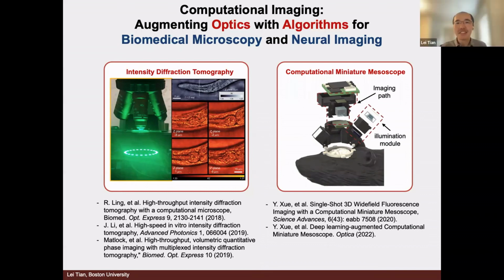Thank you. I'm interested in everything, basically, but in the interest of time, I'll ask something about the first part, on a particular application. With Pierre, for example, we're trying to put together a little computational microscope for pollen imaging in honey, to determine which kind of flower origin the honey comes from.